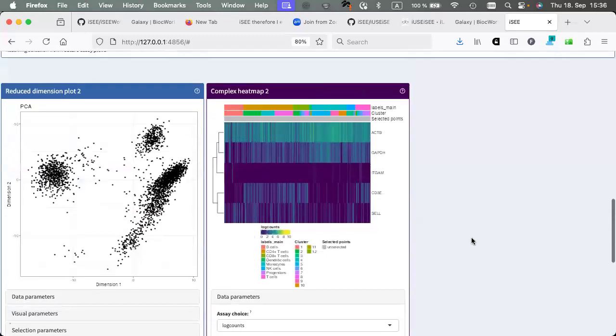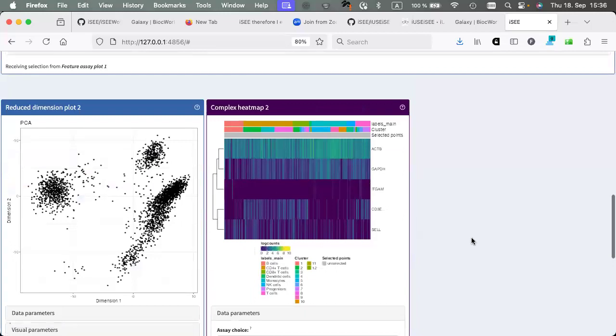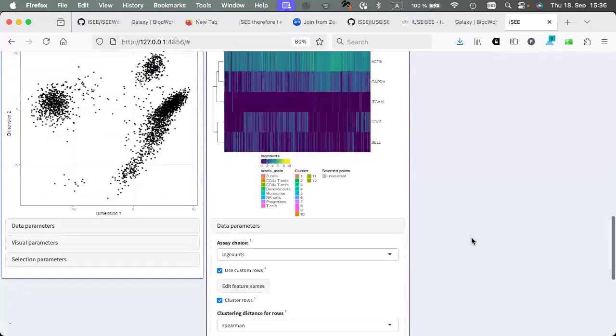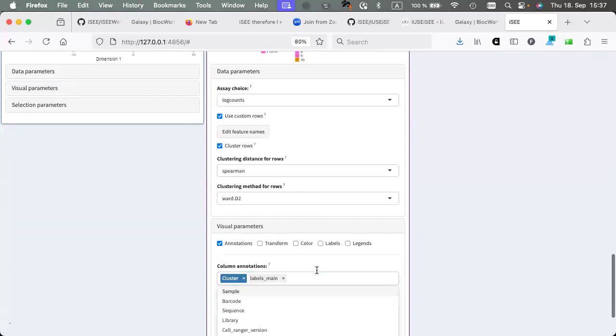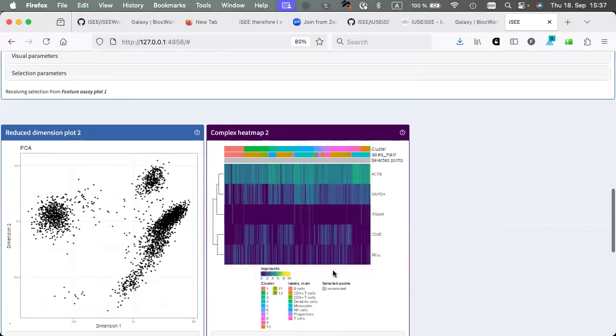And what I will obtain, I can put like out of the blue, so the cluster 1 chooser. So these are the number of the cluster. It's normally ordered by the first one that you select. So if I change that to being like this, it will, of course, put the cluster first on top without splitting them, and then it will change the labels here.